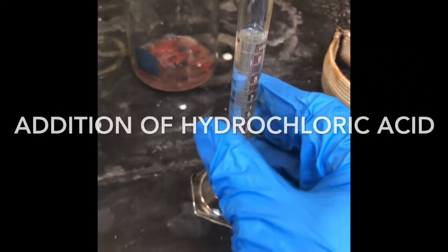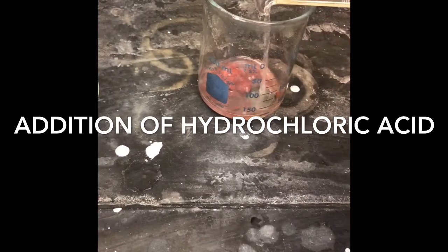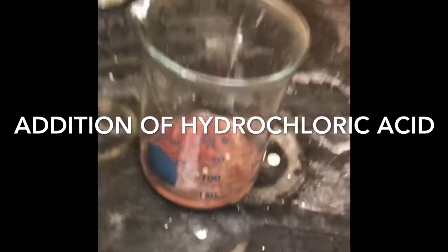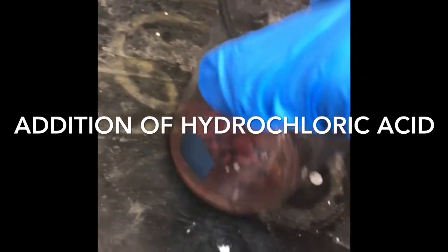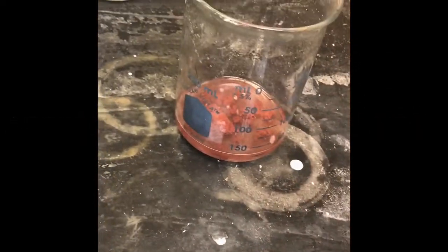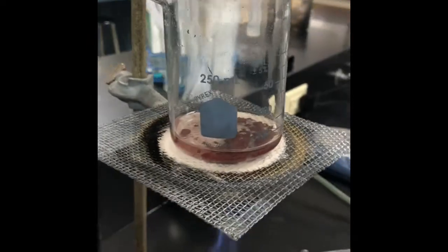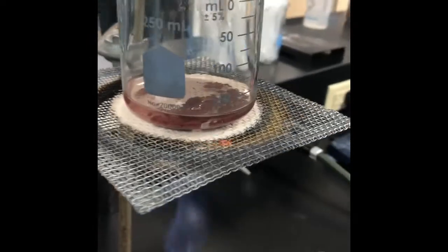We'll go to the next part of the lab, which is to measure out 10 milliliters of hydrochloric acid, and we're going to add it to our copper solution. And it's going to drive off any extra zinc that hasn't been reacted. So we're going to leave this in the fume hood for a couple minutes and make sure everything reacts. We're going to warm, but we're not going to boil after we've added the hydrochloric acid to our mixture.